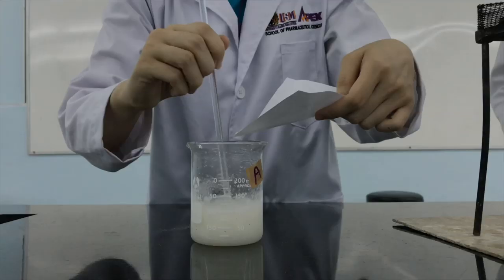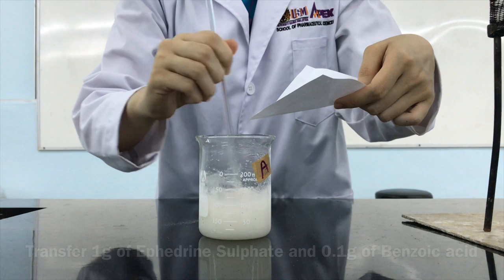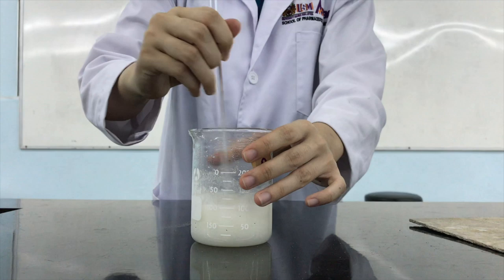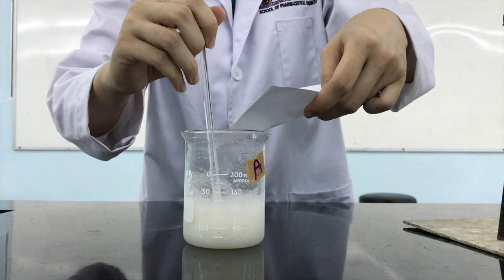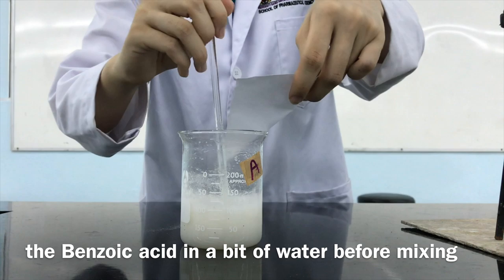When the temperature is 60 degrees Celsius, transfer 1g of the ephedrine sulfate and 0.1g of the benzoic acid into the beaker, portion by portion with continuous stirring. You might dissolve the ephedrine sulfate and the benzoic acid in a bit of water before mixing with the gel base to ensure better mixing.